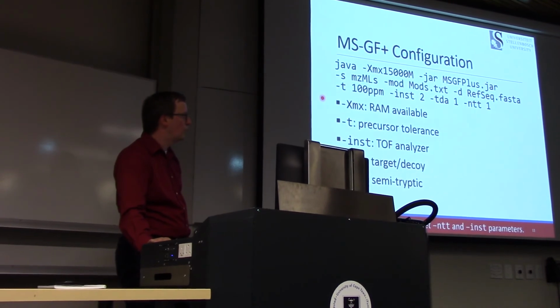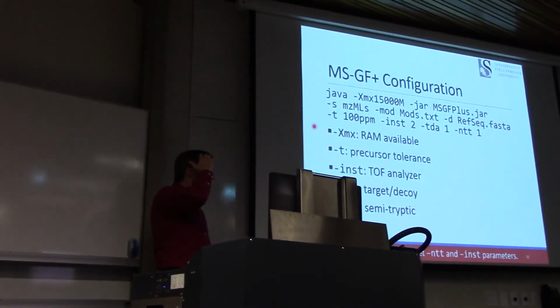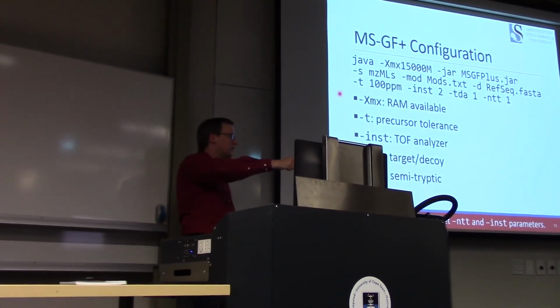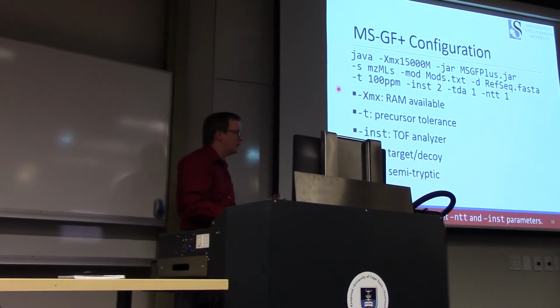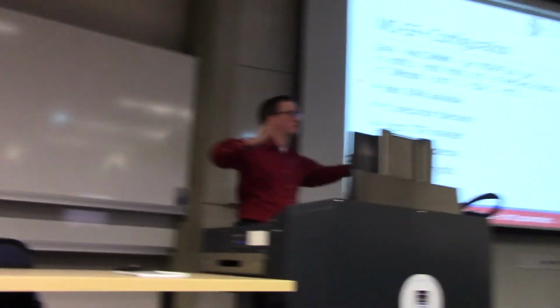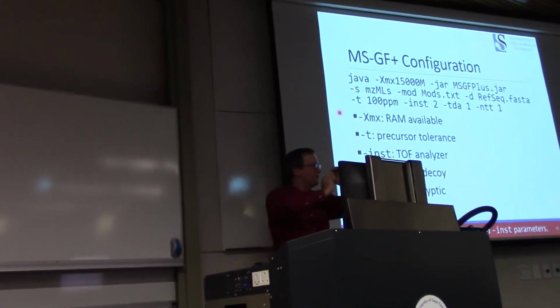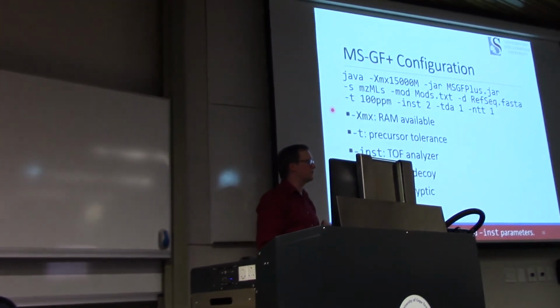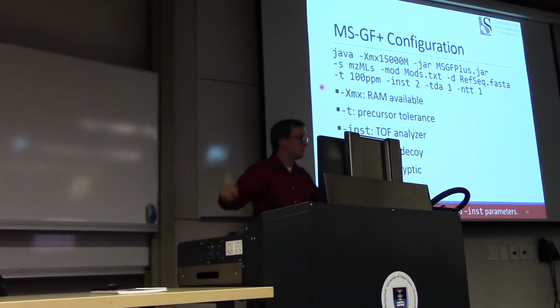No, that's a misunderstanding actually. Just because you compare more sequences to a particular precursor doesn't mean target decoy falls apart. Target decoy falls apart if you force the precursor tolerance very narrow. So if I ran this to a 1 ppm search, then I could no longer trust my target decoy assessments. But increasing it to a broader one, that's not a problem actually.